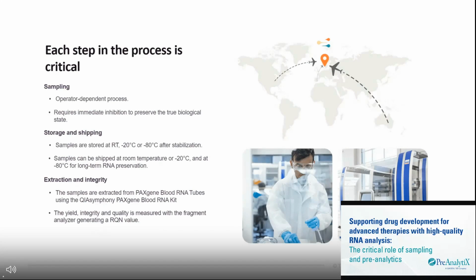In drug development, every step from sample collection to the final analysis is critical. Why is that? It's because we want to preserve the phenotype from the patient. This is very critical. Sample and analysis should represent the patient phenotype. We focus on biomarkers, which are molecular indicators of disease progression or treatment response. The key to trustworthy biomarker analysis is having full control of the sample journey.